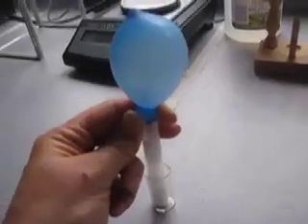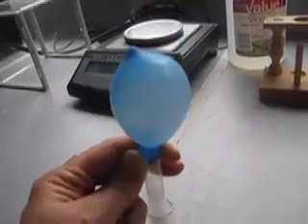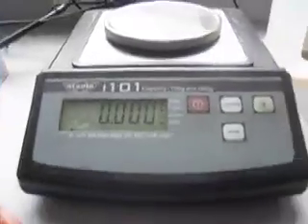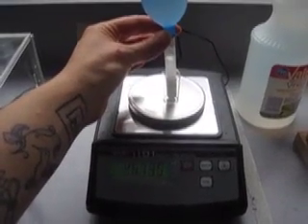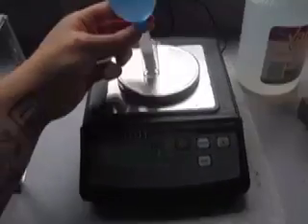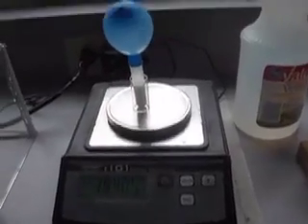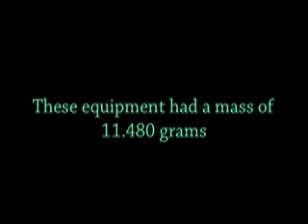I have combined the acetic acid and the sodium bicarbonate and now I'm going to weigh all of them together. Ideally I'll be able to weigh everything with my hand still on the balloon, then let go and weigh it. Here we are zeroing. I'm going to let go of it and hopefully it will not fly off. Our final mass of the two things mixed together — and remember there was fizz — is 19.405 grams. This is including all of our equipment: test tube, test tube holder, and balloon. The equipment had a mass of 11.480 grams.